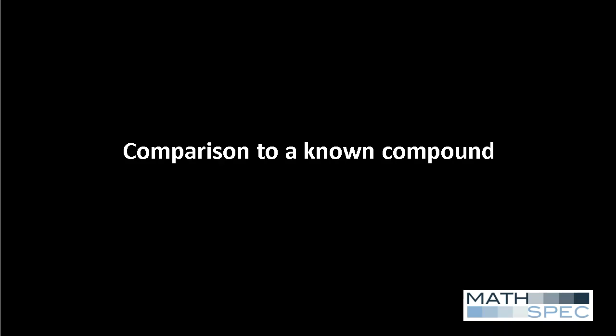I'm Dan Sweeney from MathSpec Incorporated. In this video, I will demonstrate how our Excel add-in can help identify an unknown compound from its accurate mass MSMS data by comparing the modular structures of the unknown compound to modular structures of a similar known compound.